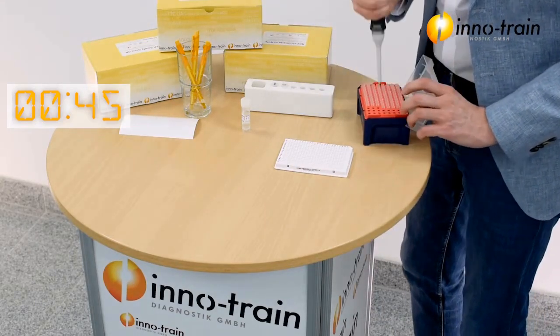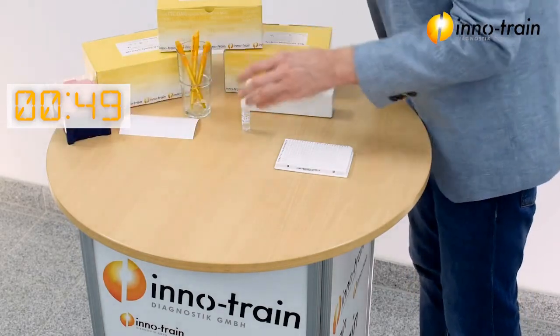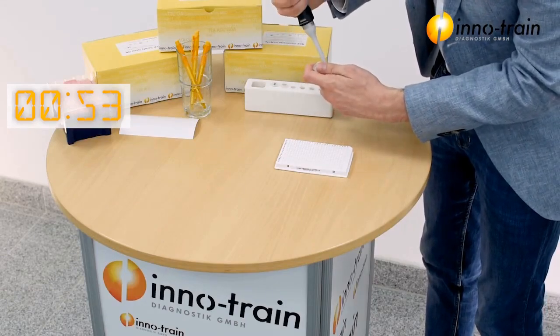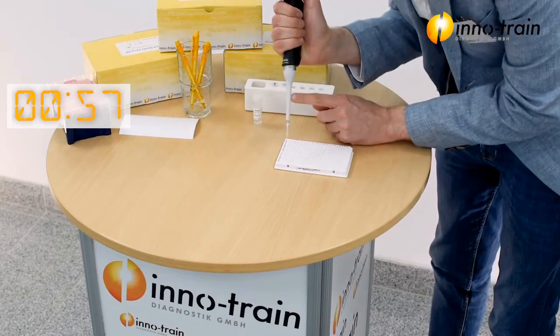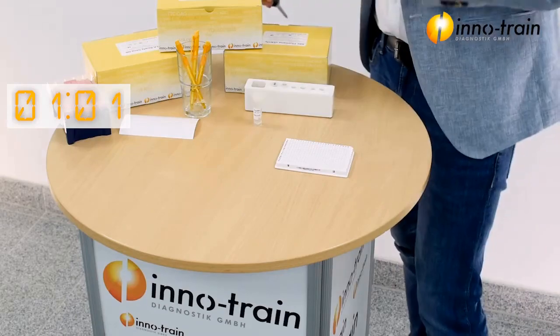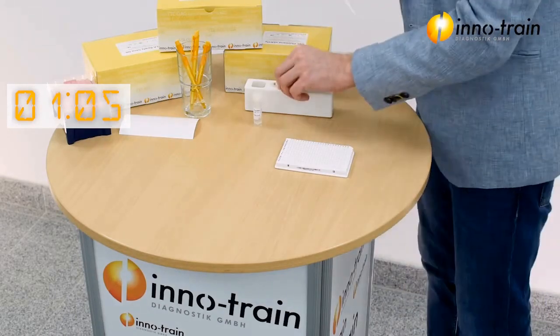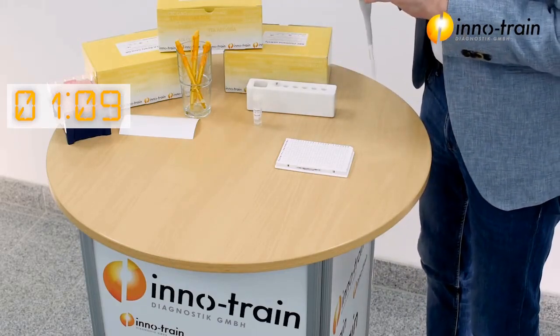Then we add another 4 microliters of our FluoMix. This goes also in P1. In the next step, we already prepare a sample. For this, we have DNA, 1 microgram of it.